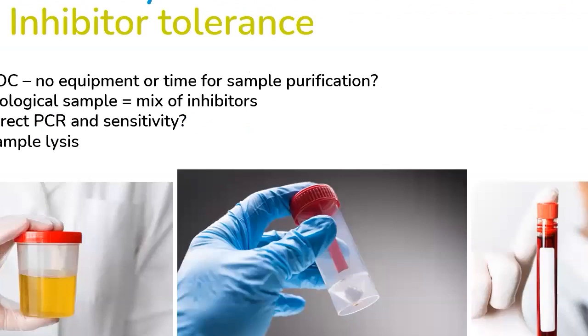In a point-of-care setting, there is often no equipment or time for sample purification, but often sample purification is the first step in all kinds of PCR experiments to get rid of all the other components, so you would end up only with the nucleic acid that you're then going to detect. A solution for that, if you are not able to perform the purification, is to add the biological sample directly to the reaction.